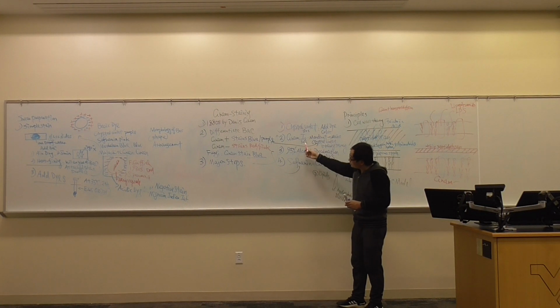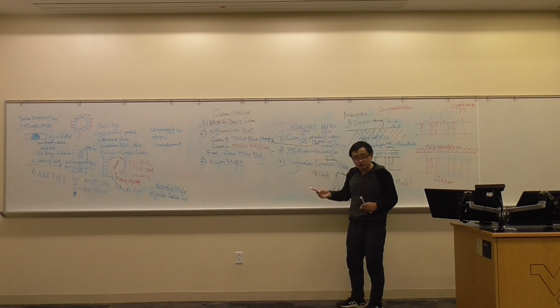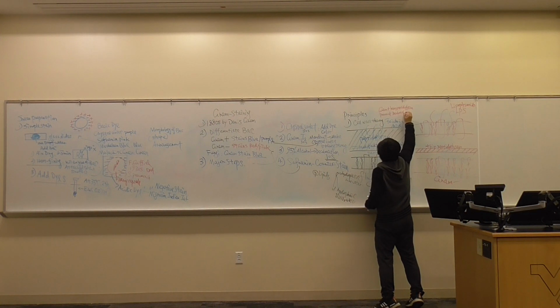You add gram iodine, it stays strong. Then because of the heavy peptidoglycan, when you do 95% alcohol decoloration, it's not going to wash off. It prevents decoloration by alcohol.